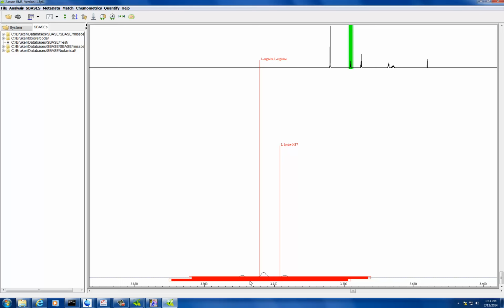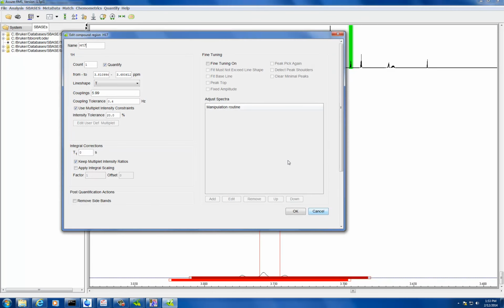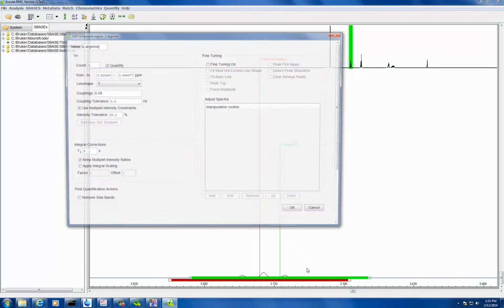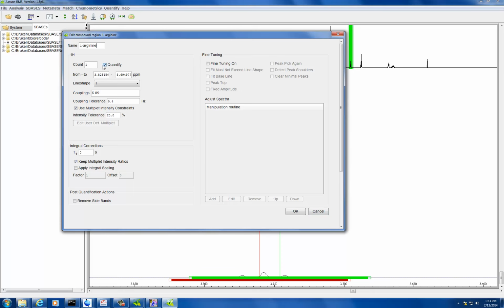We're going to turn those off. For each of the individual regions, we're just going to go near it, hover around it, move the mouse down, and then right click, edit region, and then on top, to quantify, we're going to turn them off. And then the other region below it, I'm going to turn that off too. So you see it's very much interactive, where you're telling it what it should do.